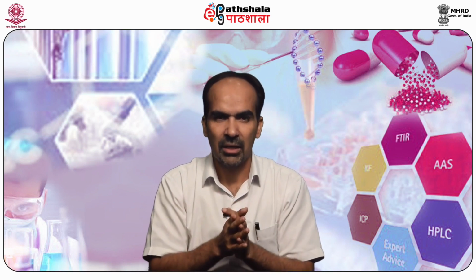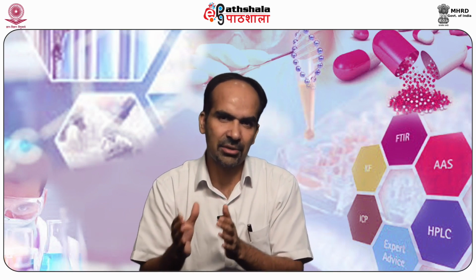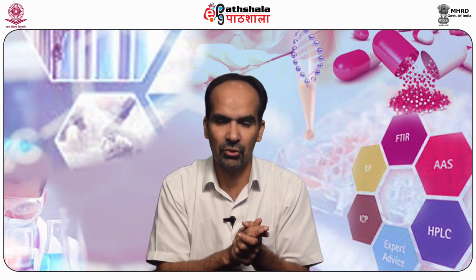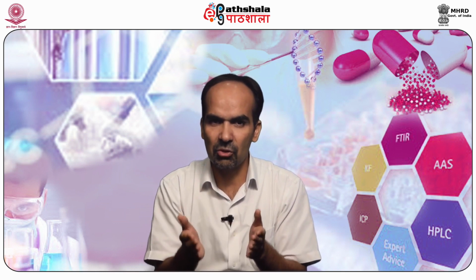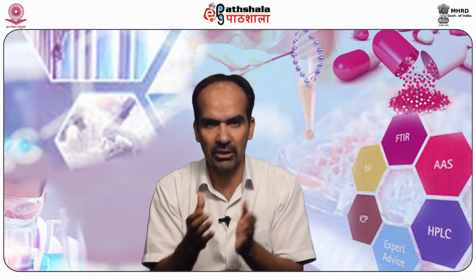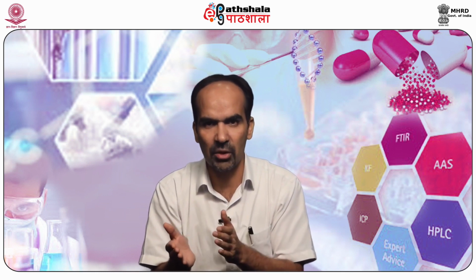Now let us discuss the assay of cinchona alkaloids in cinchona extract. A cinchona extract is a soft extract made with strong alcohol containing at least 10% of total alkaloid. So the procedure goes like this. Mix about 2 grams of this soft extract with 5 ml of water and 5 ml of ethanol, 95%, and add 1 ml of 1 normal HCl to the mixture.